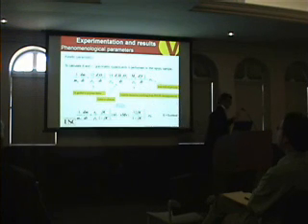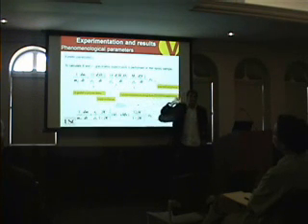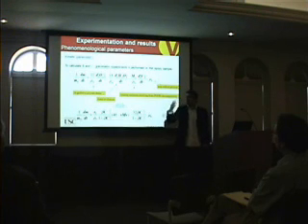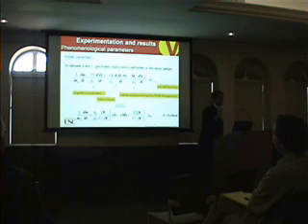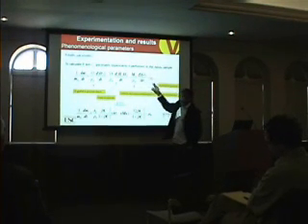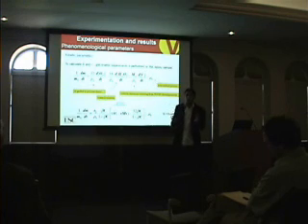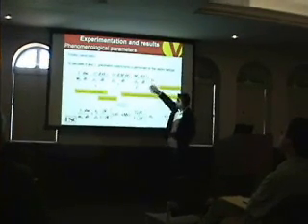When the oxidation happens, it has some byproducts, like water released from that. So you lose some weight due to the water, and you lose some weight due to the other volatiles, like carbon monoxide, carbon dioxide, or we couldn't exactly detect what those are. And also you're going to lose some weight due to, as I told you, thermal degradation. So we have to deduce that one here too.